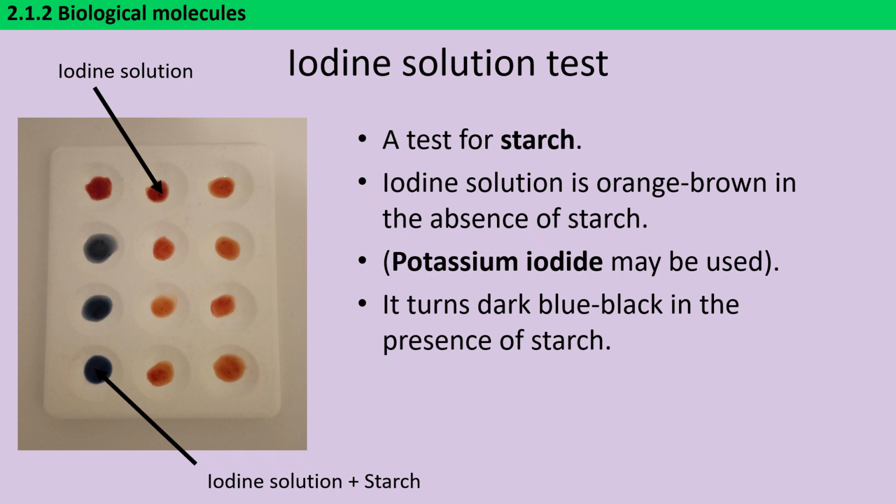In the absence of starch, this solution is sort of orangey brown, but in the presence of starch, it turns dark blue-black.